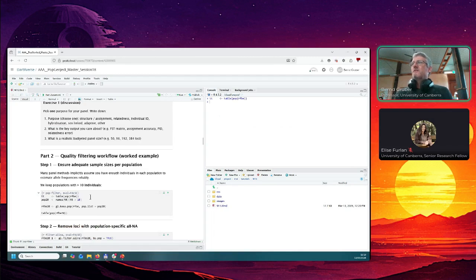First of all, we do some filtering in terms of the individuals, because when you want to look for a population structure, it may make sense to not include all the populations, because for some of them you only have 1 or 2 individuals. And even if the panel would recreate this population nicely, you're basically pretty unsure if that's representative of the rest of the population.